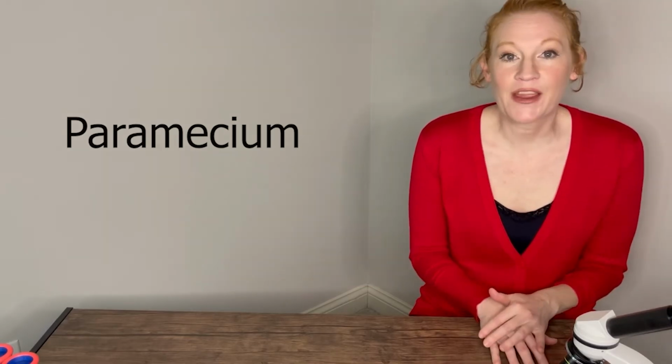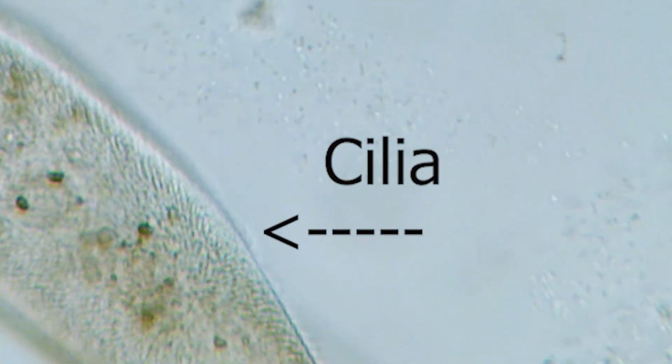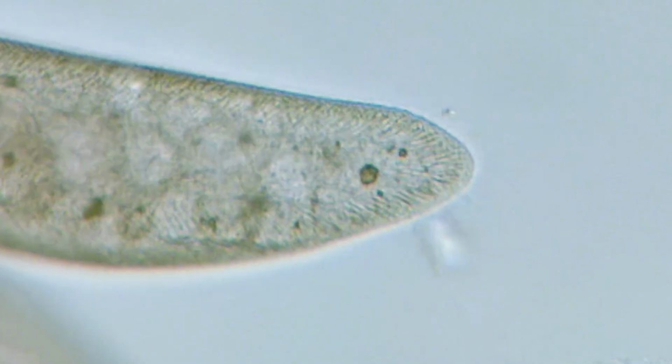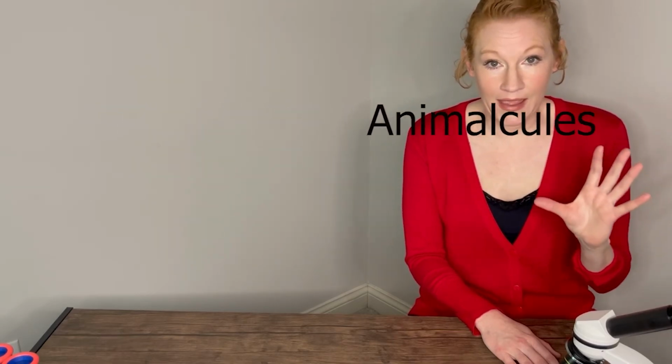Well, it looks like Dr. Von Beatbox has found a paramecium. Parameciums are ciliates, like rotifers, except paramecium have cilia that surround their whole body and it helps them swim. Now, they used to call microorganisms animalcules, kind of like molecule, but animalcule meaning a microscopic organism, basically.